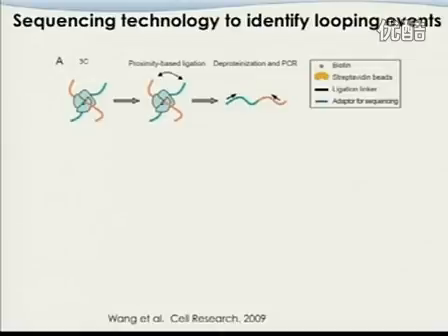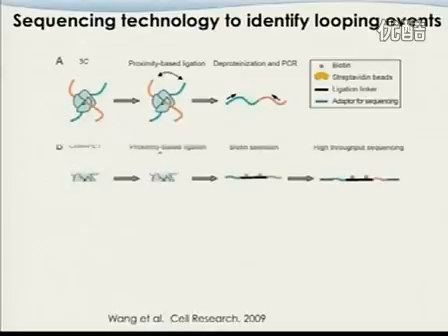And then you do the paired-end sequencing. So if one end after mapping is in this location, and the other end is in this location, you know that in the real cell they are physically pretty close to each other. Okay? Again, this is a protein, and they bring these two DNA molecules together. You do some cutting here using restriction enzyme sites, and then you ligate them back together, and then you sequence from both ends. That's the way to do it.